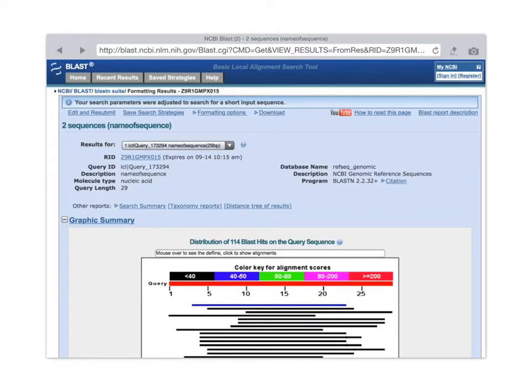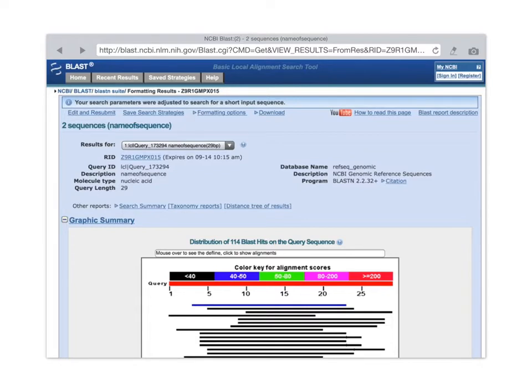And here we see some important results. There are 114 matches of the sequence that I randomly generated and entered that I called Name of Sequence.